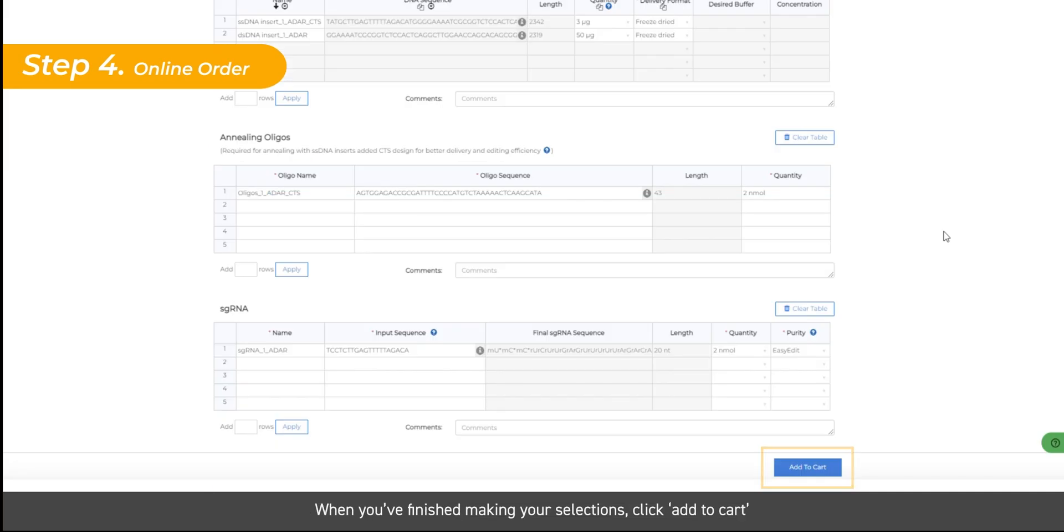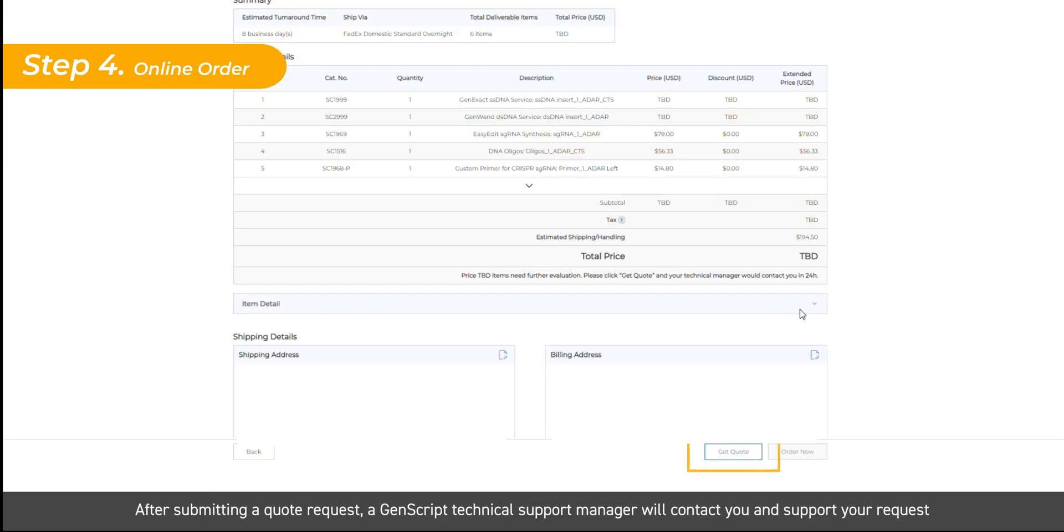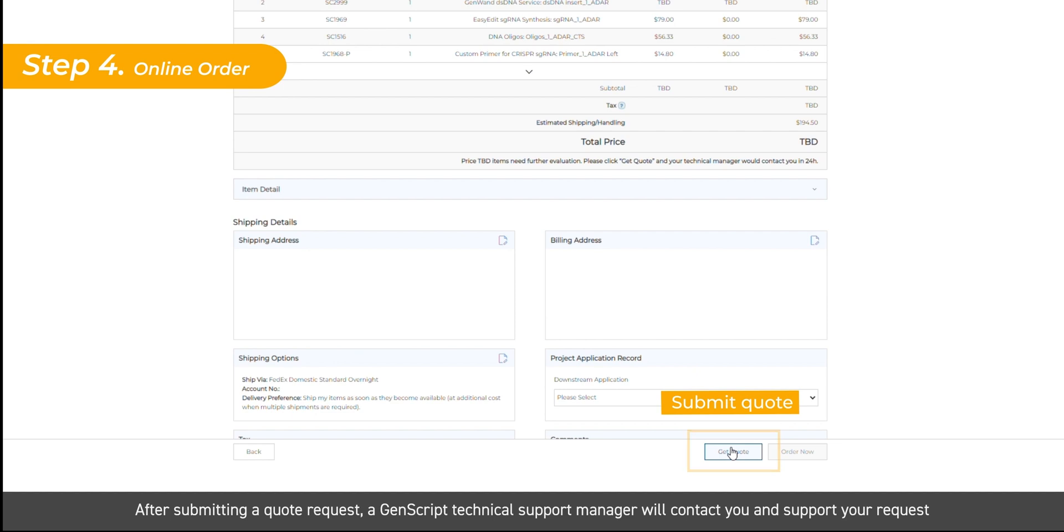Once you've finished making your selections, click Add to cart. After submitting a quote request, a GenScript technical support manager will contact you and support your request.